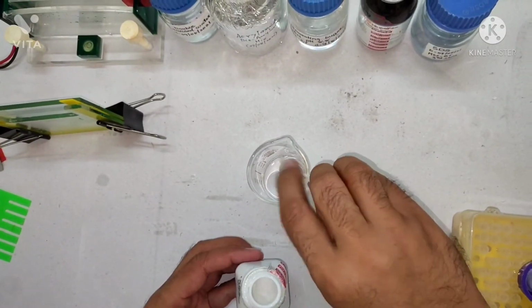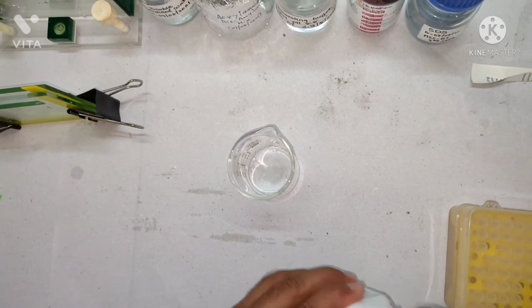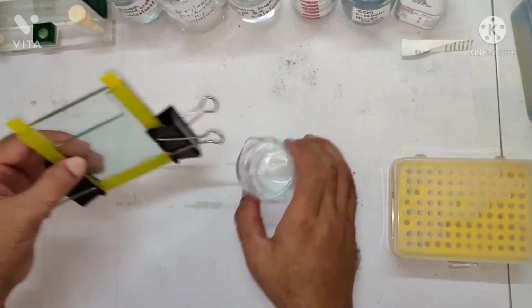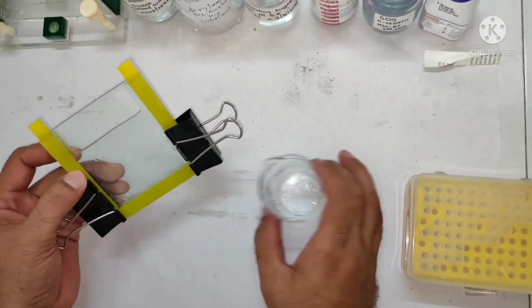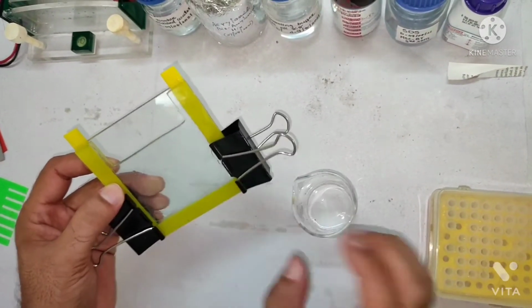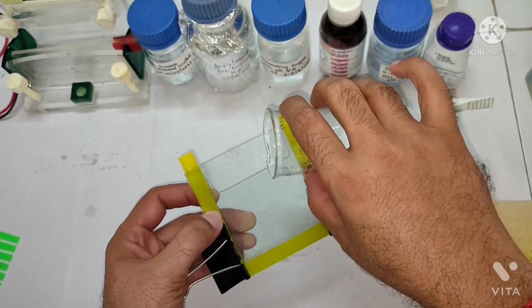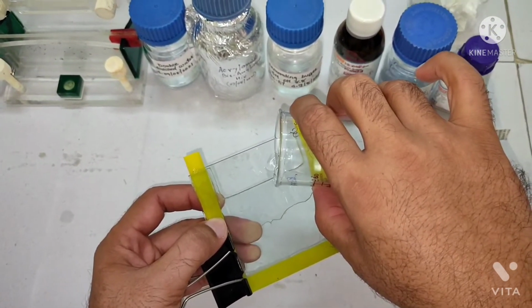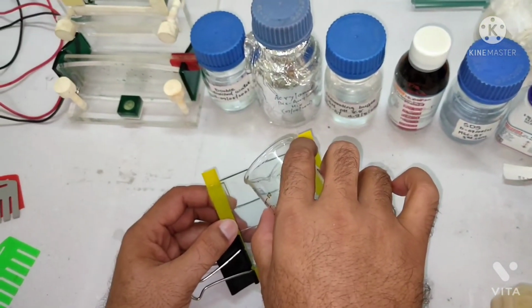So you can add, and as I added this, the polymerization started now, right? So now you should do things very quickly. You should pour it now, right? So we have to pour approximately 2/3 of the plate, right? From the notch plate you have to take. So up to here we have to pour. So you pour it quickly with the help of a pipette, or you can pour it like this also. It depends upon how much practice you have. Now you put it like this, and a little bit more we have to add.